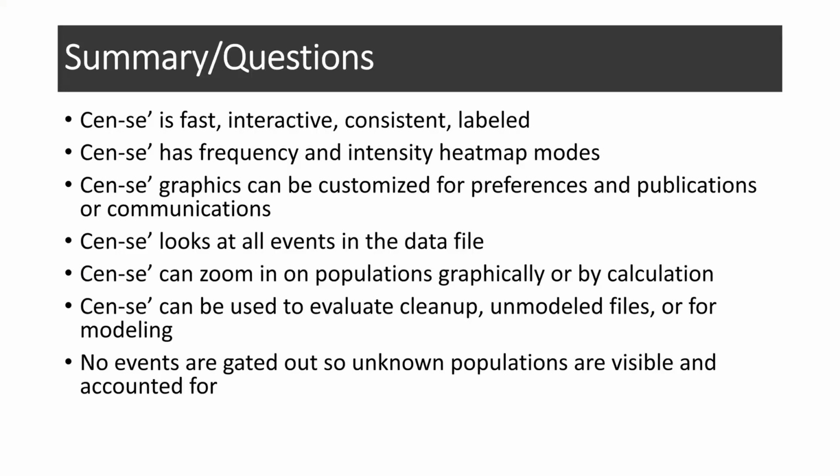It looks at all of the events in the data file. Every event is accounted for, and you can delve deeper into those unaccounted events. With the Cen-se, we can zoom in on populations graphically or by calculation. A Cen-se can be used to evaluate the cleanup, unmodeled files, or for the modeling process. Then no events are gated out. And this is really important, so that no unknown populations are lost. They're all visible and they're all accounted for. I showed you that CD14 dim population. And it's really important when we start looking at rare and unknown events that we know exactly what we're looking at.